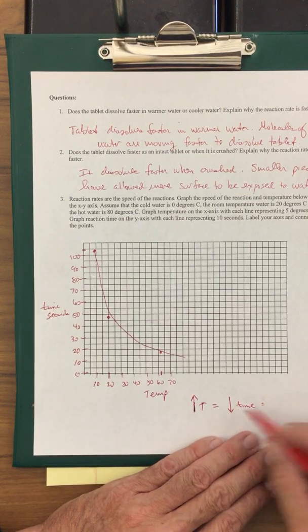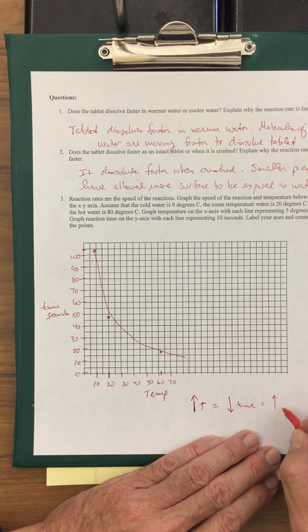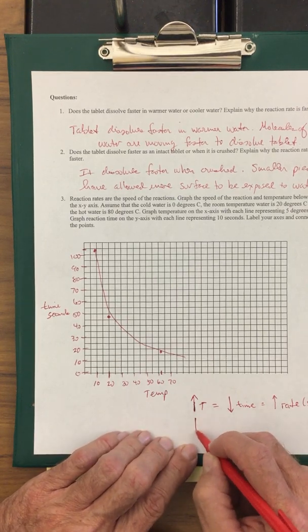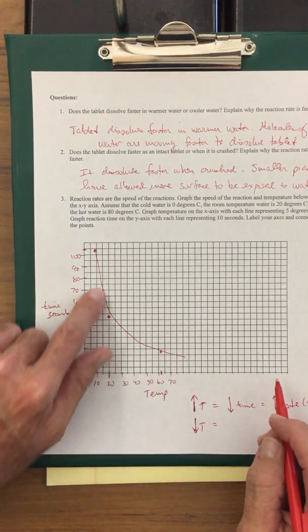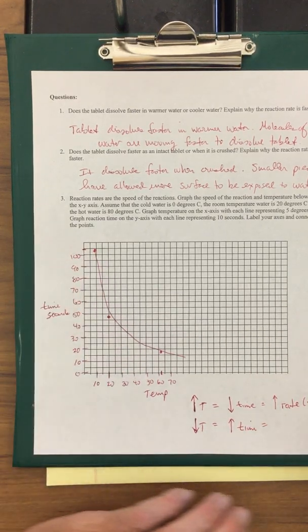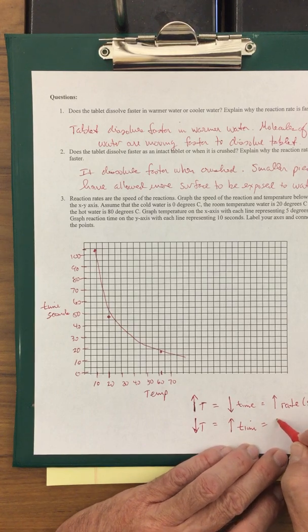If you have a very short time, you're increasing the speed, or increasing the reaction rate. And vice versa. When we decrease the temperature, lower temperatures over here, our time is increasing. If it's going slower, our speed is going slower as well.